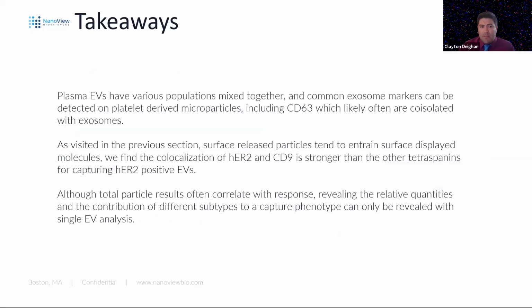Common exosome markers can be detected on platelet-derived microparticles, including CD63, and these are likely often co-isolated with exosomes when you have these types of fluids. And as we visited in the previous section, the surface release particles tend to entrain surface displayed molecules, and we find the colocalization of HER2, a surface displayed cell marker, and CD9 is stronger than the other tetraspanins for capturing HER2 positive EVs. So maybe not intuitive off the bat, but when we know more about the mechanistic nature of the CD9 released particles, it makes perfect sense that that's where we would see the strong correlation with the HER2 display.